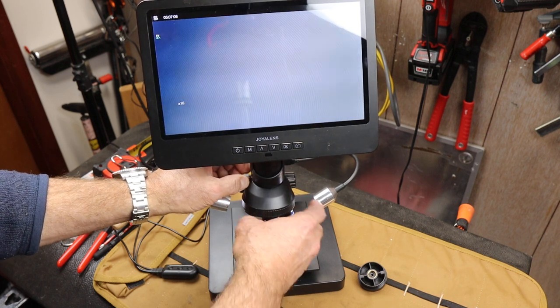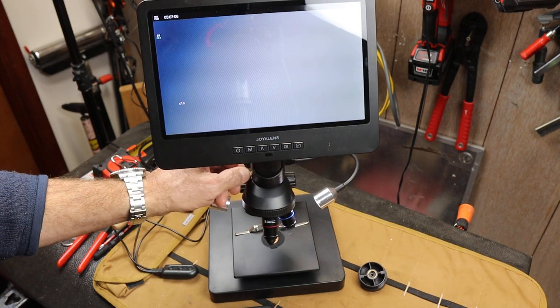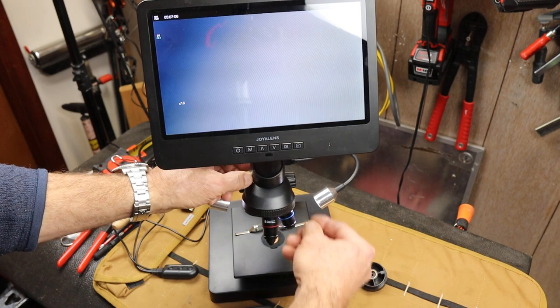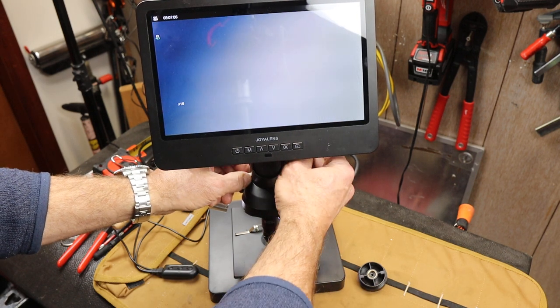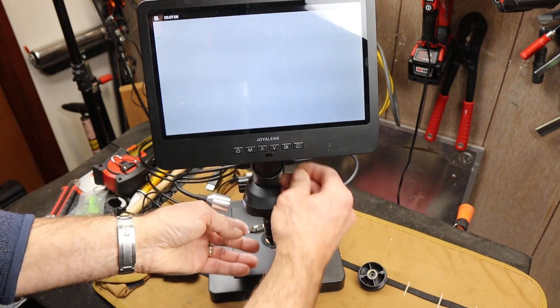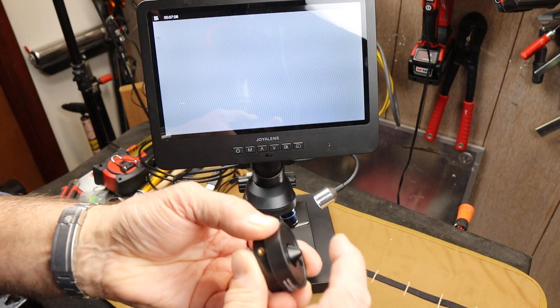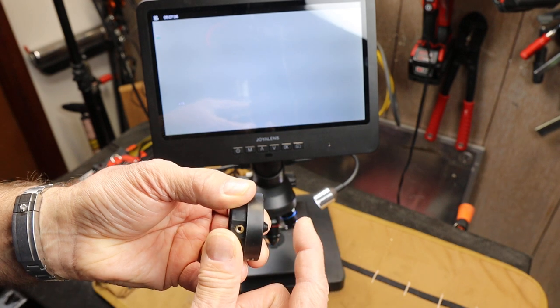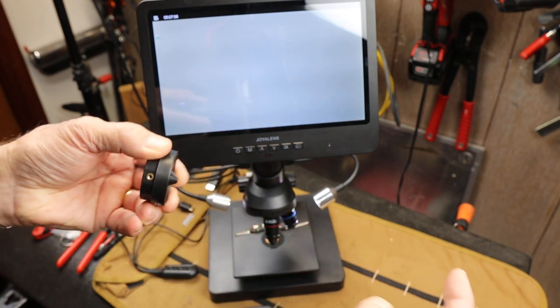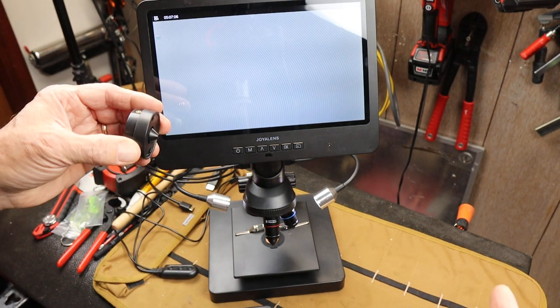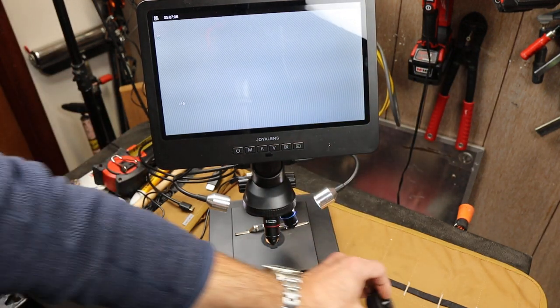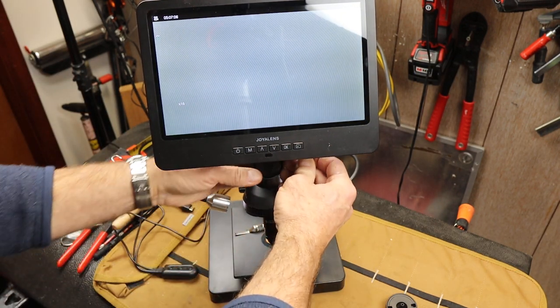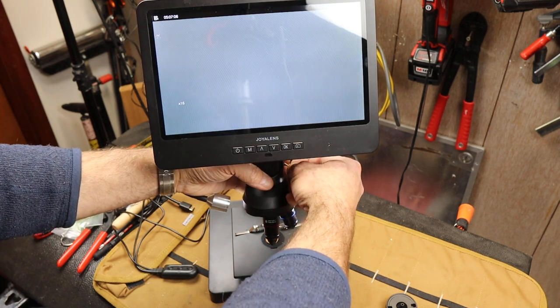By the way, the whole camera is held in to a collar by two set screws, which I'll show you afterwards, which allows you to immediately take this thing apart. And the actual focus range here is from 12 millimeters, a little over a centimeter, to about a foot, or 320 millimeters. So if I pop this out, I can actually use it for other things, which is kind of nice, put it in a different stand.